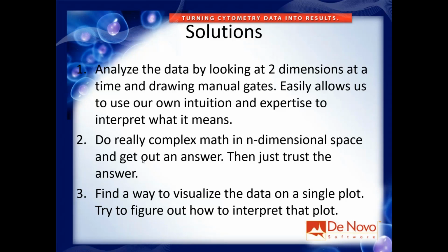So that's one way. That's not that common in flow at the moment, so we're not going to talk about that anymore. The approach that is becoming common is to find novel ways of visualizing all this multi-parameter data on a single plot. And then when you get this plot, you have to figure out how to interpret it and what it means.